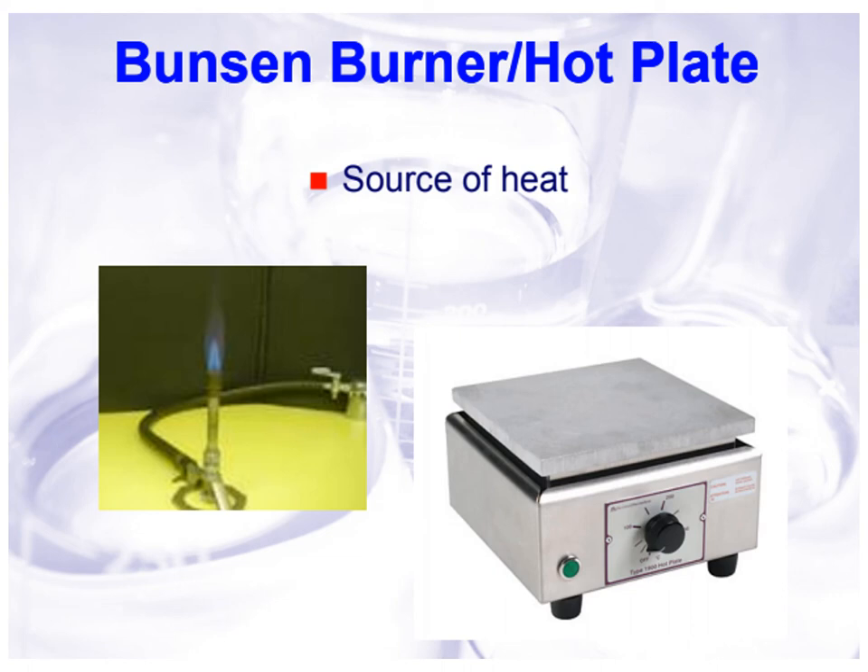Today, Bunsen burners are no longer used for sterilizing loops and needles inside a biosafety cabinet, because it is not good to place a Bunsen burner inside a biosafety cabinet — it can destroy the HEPA filter. We also have the hot plate, and precautions must be observed when touching this equipment because it may cause burns.